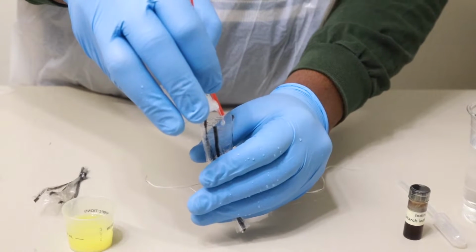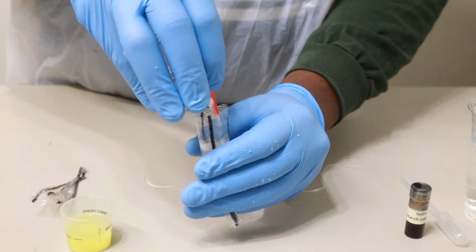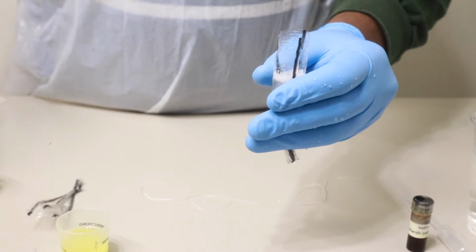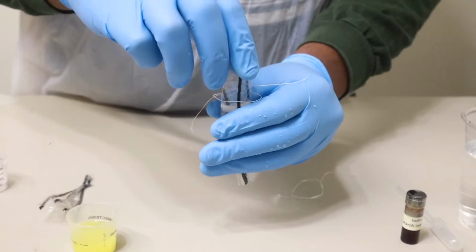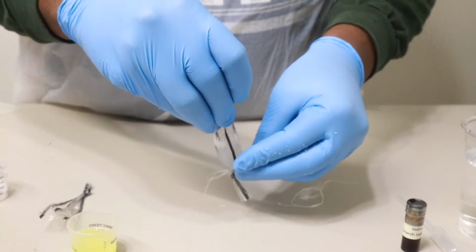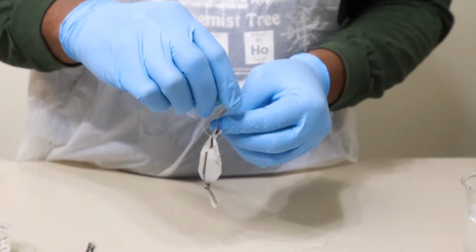So as you can see, I'm pouring very carefully. It's slowly pouring along the straw. Okay, that should be good enough. And now, while that's in, I'm going to slip my knot over the top of our cell membrane and tie a knot. Cool. So we tied it. I'm going to just double knot it.